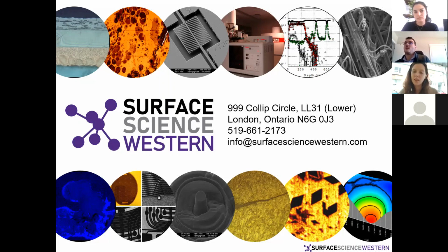You could depth profile, but I would never trust the chemistry after something's been sputtered with a monatomic argon ion source. For the most part, you would get reduction of materials. You get a lot of mixing and damage. So I would just look at quantifying; I wouldn't look too much at the chemistry. I just didn't trust it very much. But with the new gas cluster source, it's quite good.